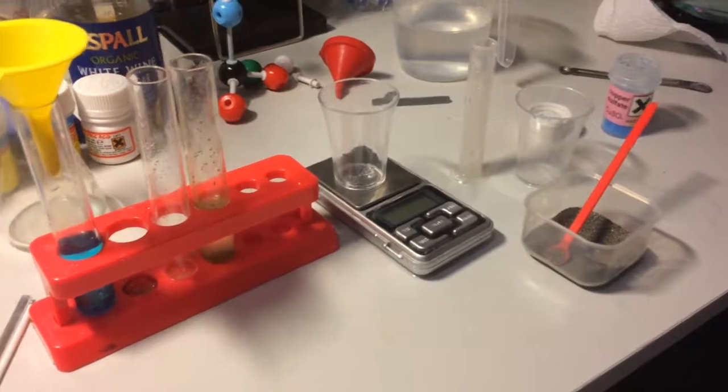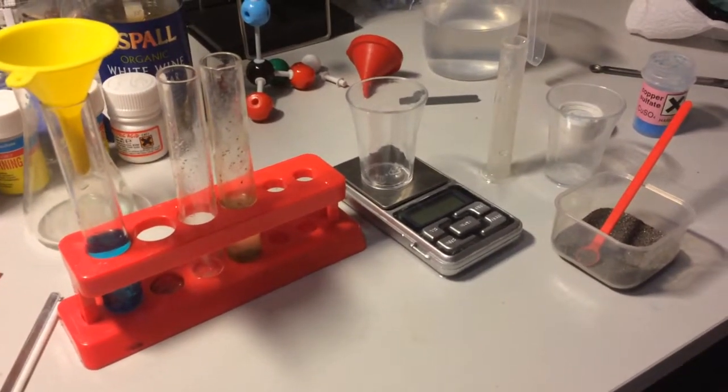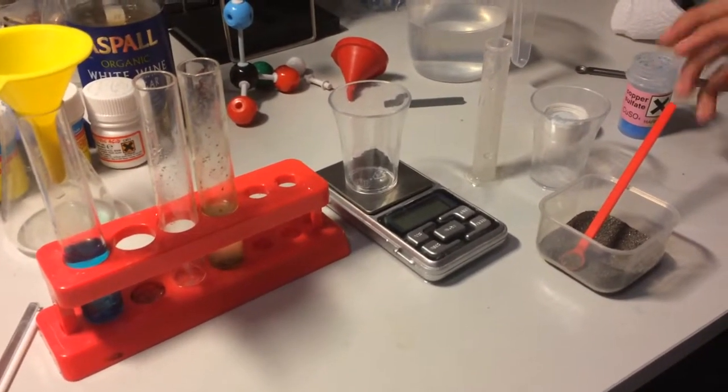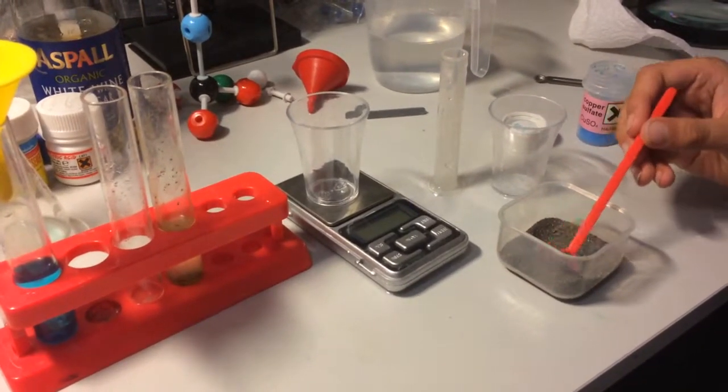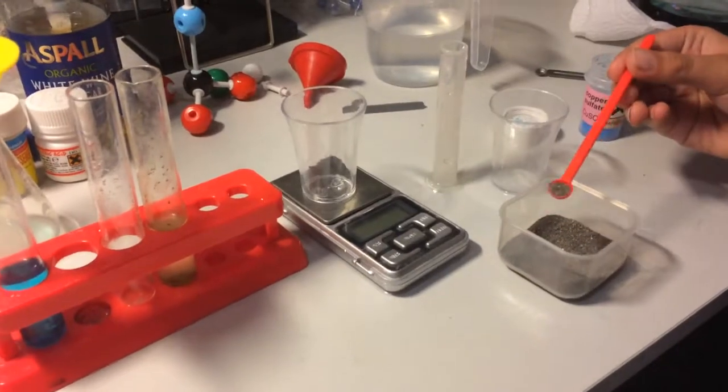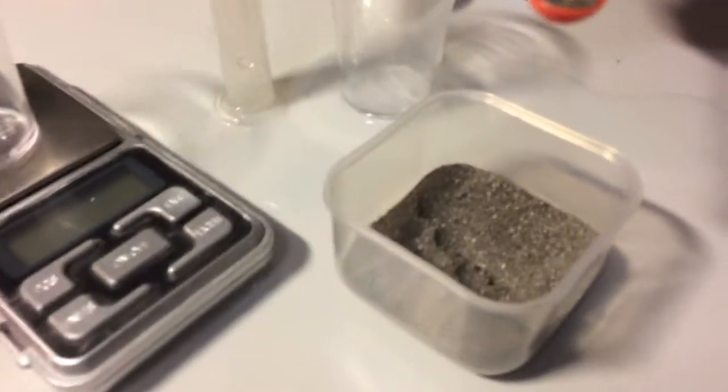Now that we have measured the temperature of the copper sulphate solution, we can now measure the amount of iron filings that we need, which in this case is 3 grams. Notice how its color is grey.